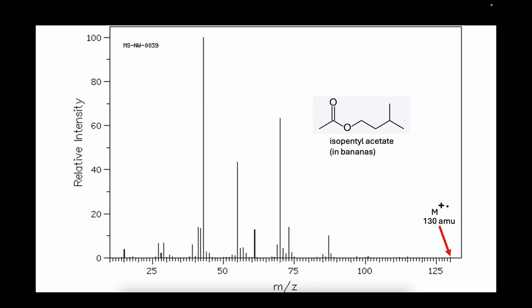That's an introduction to molecular ions. In subsequent videos, I'm going to talk about how molecules fragment. Once you get a molecular ion, what happens to it? How does it fragment? What kind of pieces come out of it? And what can you learn from that?